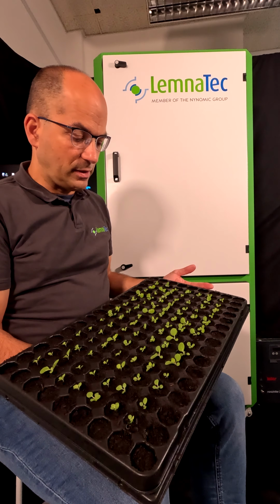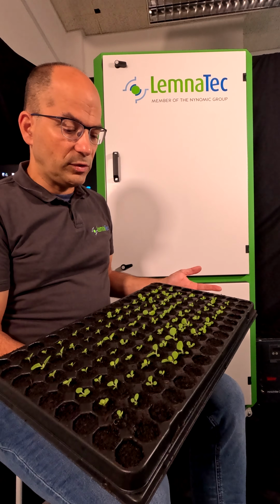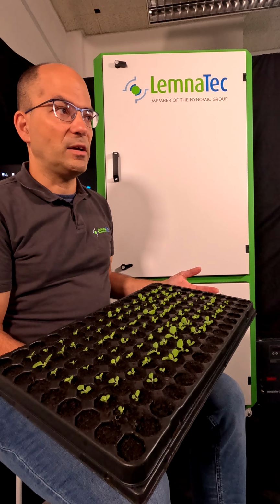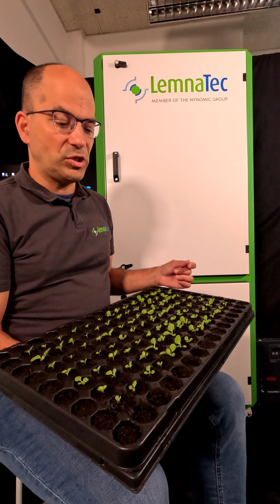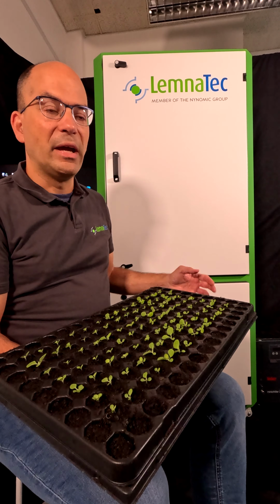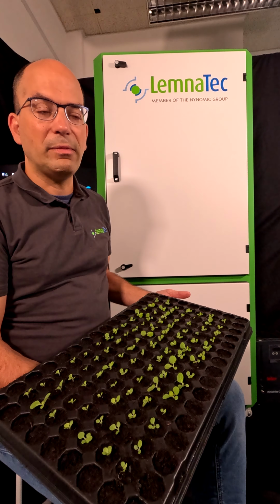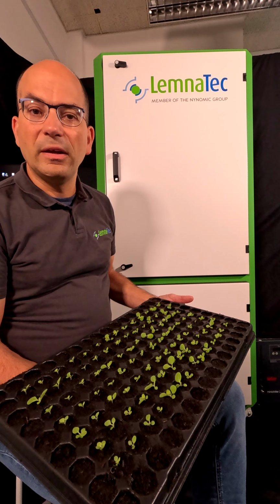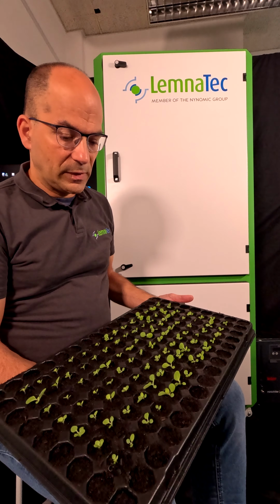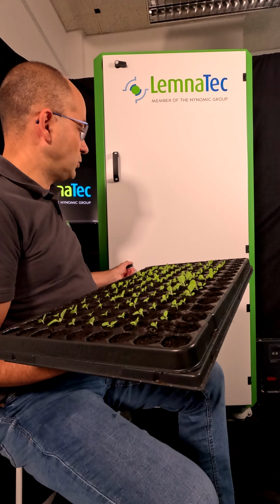Let me give an example. I have here a tray with some tobacco plants. We will use the tray to take a classical RGB image of the plants, and we will check whether in one of the plants is a luminescent signal that might come from a labeling of metabolites or microbes that could have infected the plants. So to do imaging, of course we need to open the cabinet.